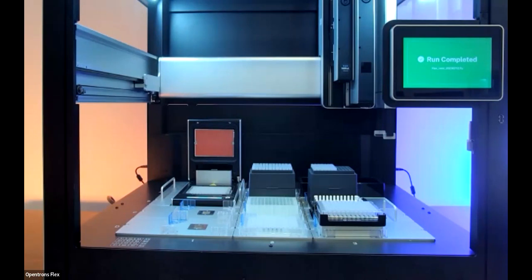Cool. As far as, is there a barcode reader? I addressed that earlier. Accessioning is a really, really key part of doing high throughput biology. This is something we're looking into. We have a couple of different options, more updates to come in coming months.